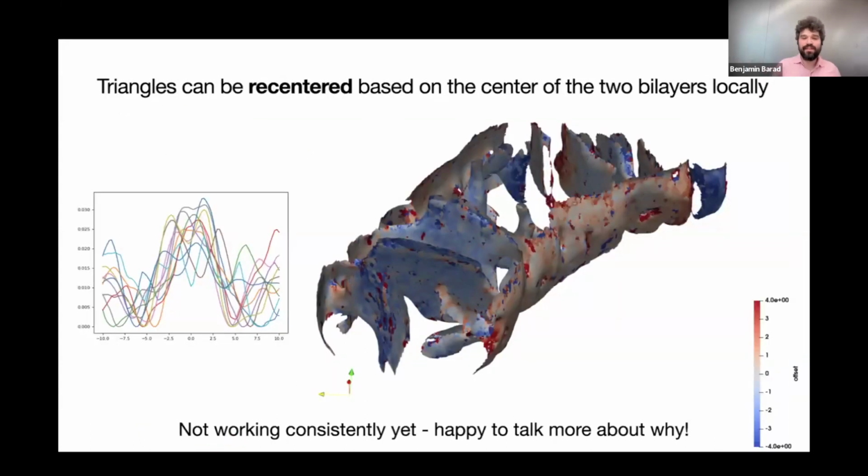The last thing we're doing that I think is hopefully really cool to the structural biologists in the audience is refinement. There's a lot of this idea that a model can only be as good as the data it's based on. In this case, our meshes are based on the segmentation, and the segmentations are only so good. They're limited by quantization noise. But now that we're going back and directly sampling the data, we can get our models to be as good as the data.